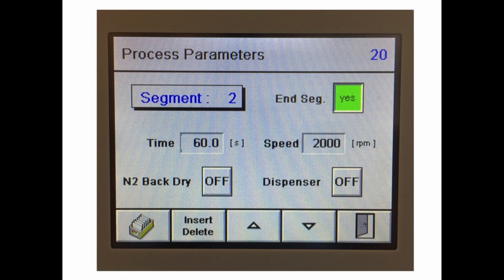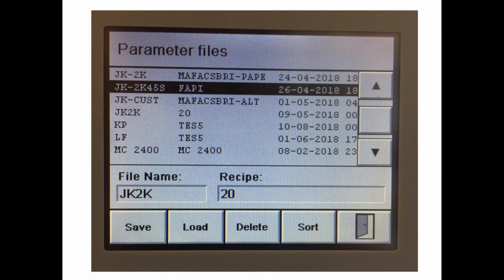Once the spin coater is programmed we can save the parameters by pressing the note cards icon, creating a new file name and recipe, and pressing the save button.